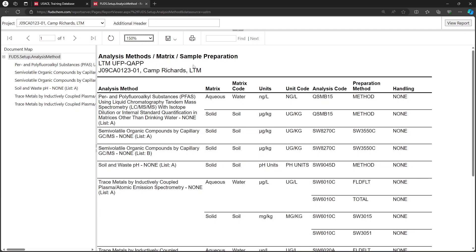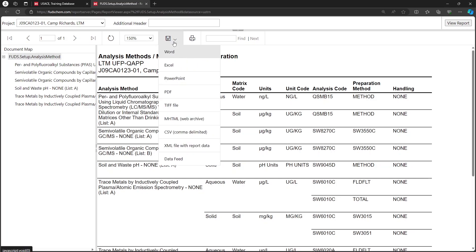All of the reports update in real time when an edit is made to the EQAP, and can be saved in a variety of formats by clicking the floppy disk icon.